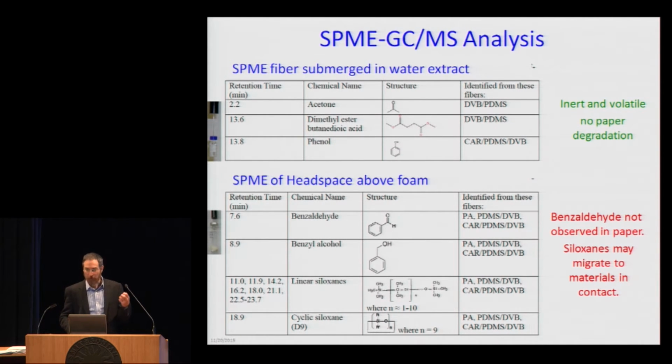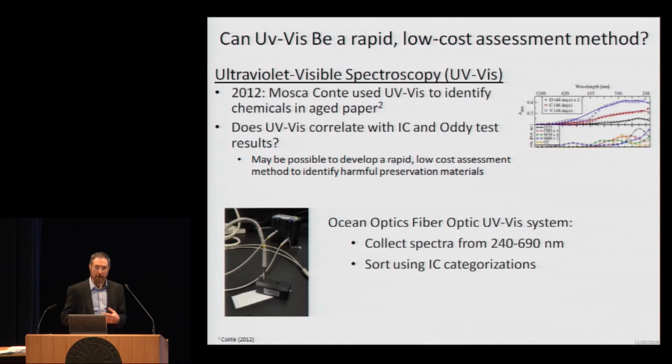And so I'm promoting this, as well as the GCMS, SPME techniques, as a way to thoughtfully consider what materials we're using and how to use those, because we probably can't get manufacturers to make the perfect material for us. I had tested 2 other polyethylene foams along with this as possibilities, and they either failed the IC test or had things like free radical generators in them from their polymerization process. And so this silicone actually turned out to be the best of the 3.